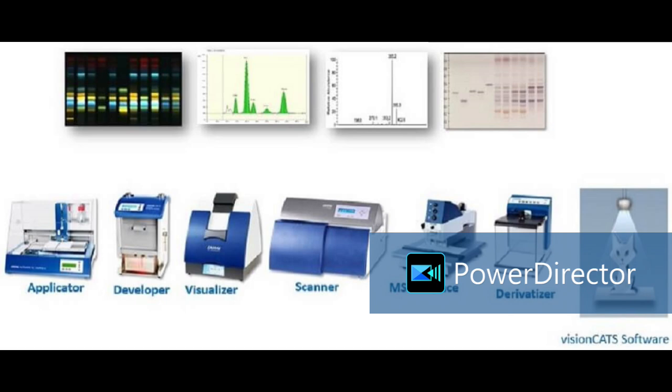Okay. So therefore visualization is very important. Along with that, scanner is also very important. Scanner plays also vital role. Then comparison viewer option is there in VisionCat software. We can compare different samples together in a stack.